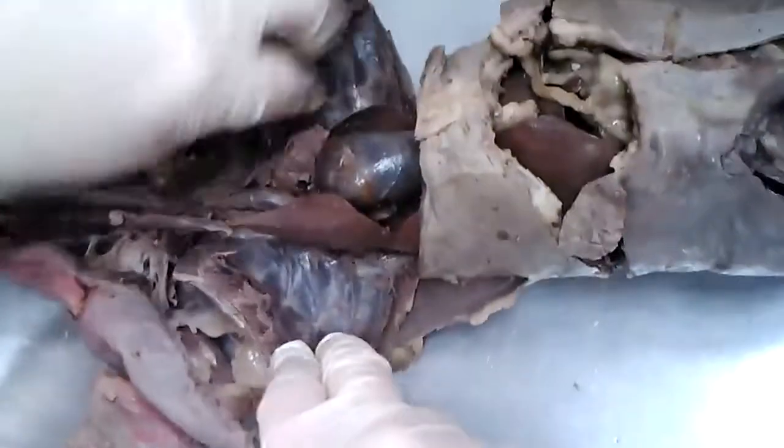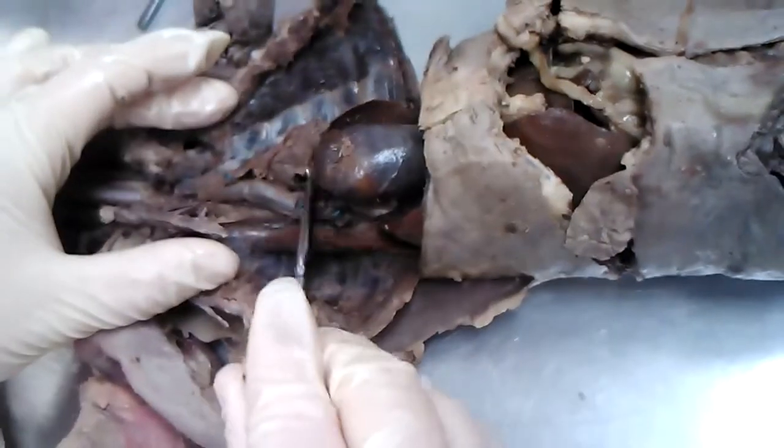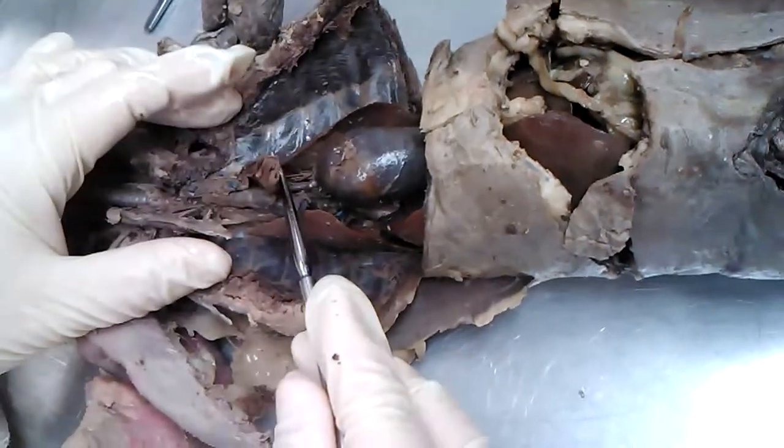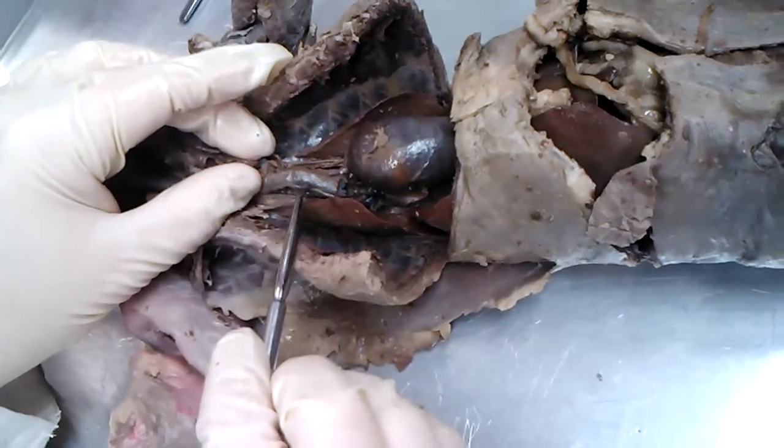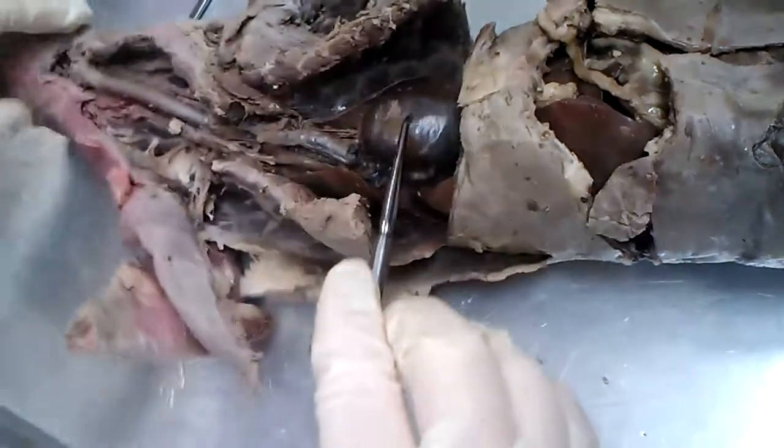Now we can come out into the mink's thoracic region here. First up, we have this organ right in here. This was the thymus. Pull that back out of the way. The large vein we see here was the superior vena cava. And of course, we have the heart.